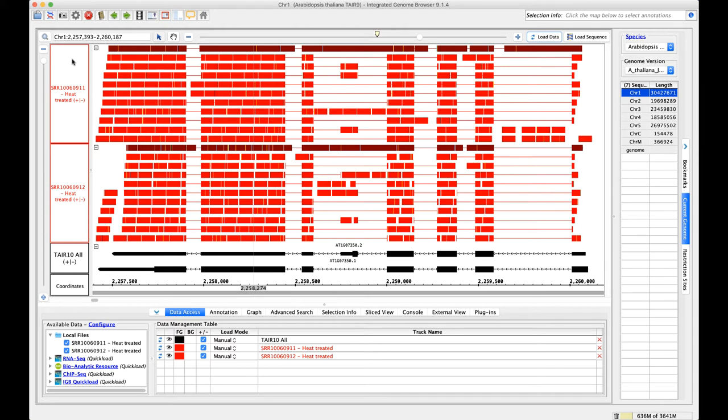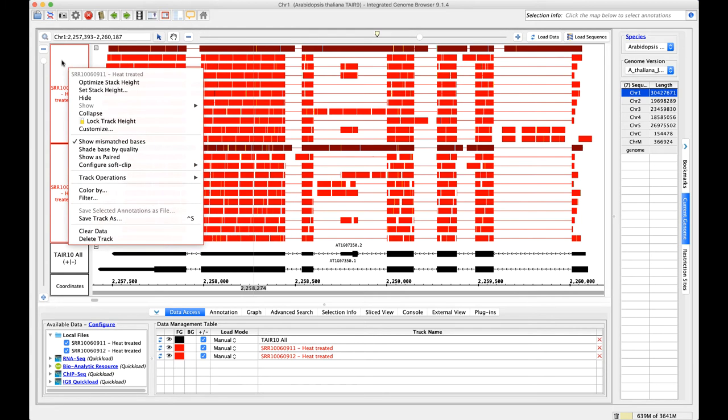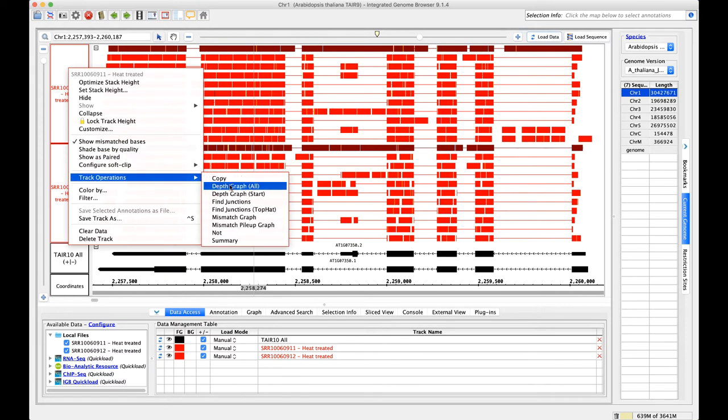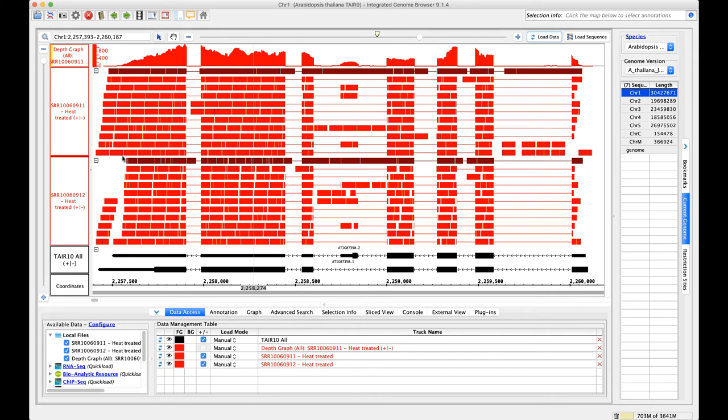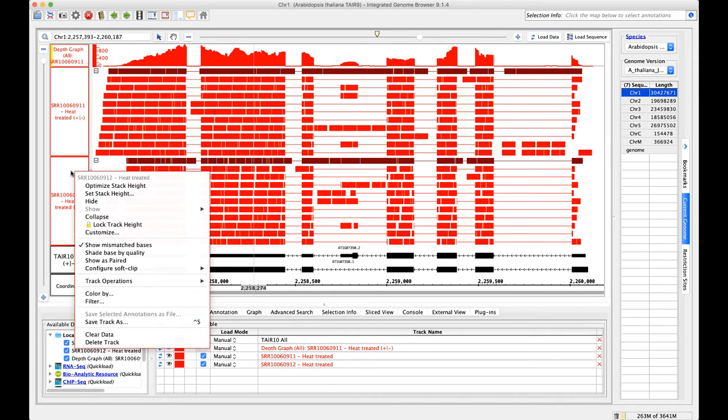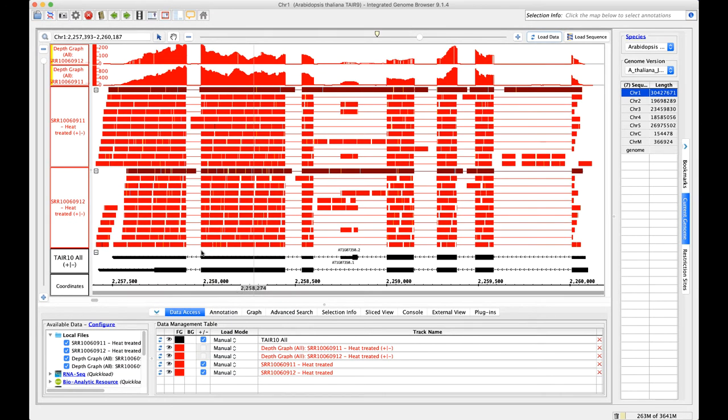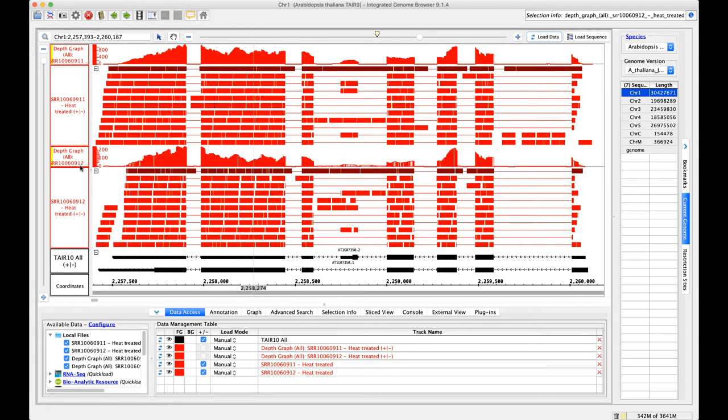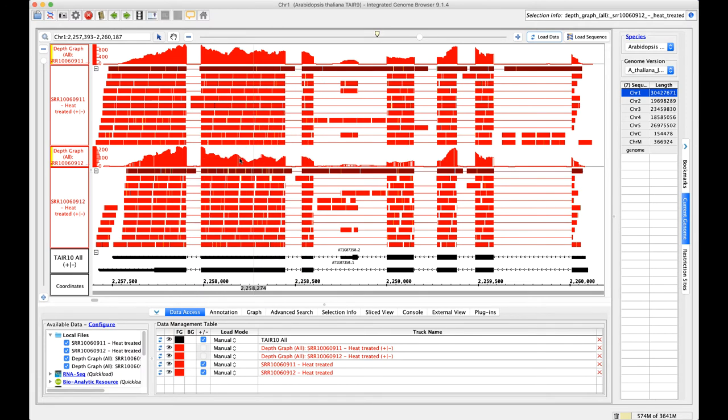There's an easy way to look at the depth of coverage for a BAM file in IGBE. It's to create a depth or coverage graph within IGBE. If you right-click on the track name on the left side, go to Track Operations, and click on Depth Graph All. Make a quick depth graph. I'm going to do the same thing for the 912 file. Track Operations, Depth Graph All. I'm actually going to drag these down and put them by their respective samples. This is 912 and its depth graph, and 911 and its depth graph.